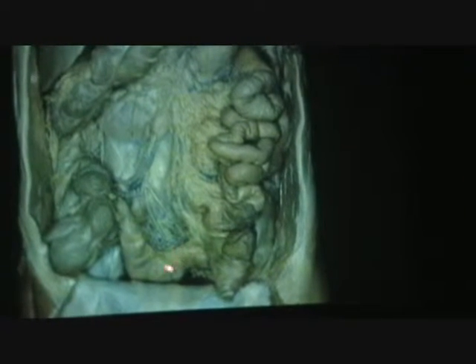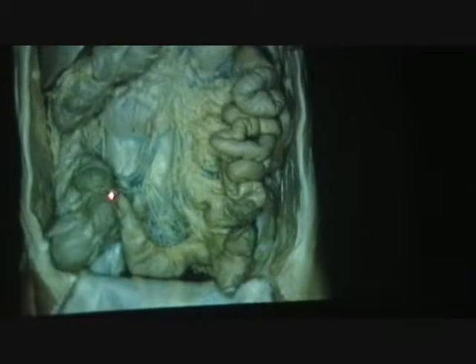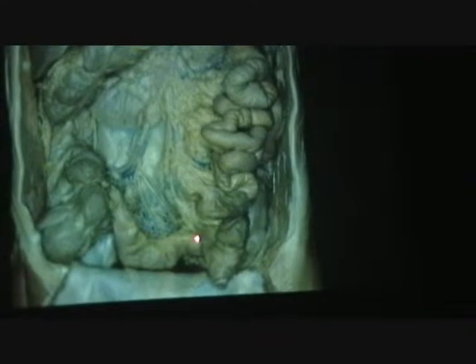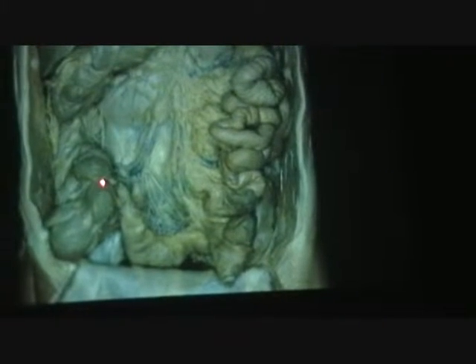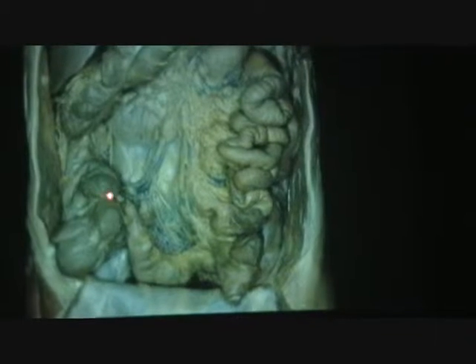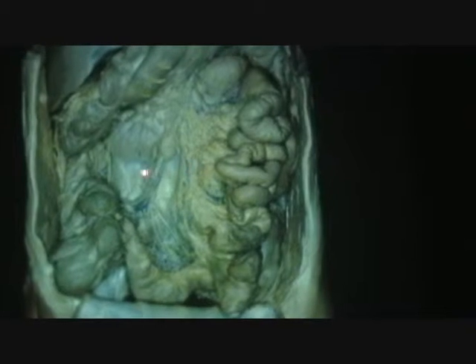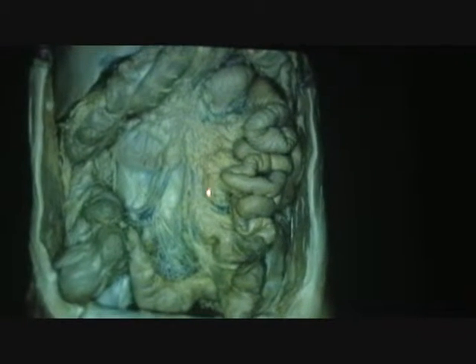What specifically would you call that? Seeing this association. Gotta be the ileum, because you actually see it attaching to the side of the colon in the lower right-hand side. What would you call that? The IC junction. Ileocecum is here. So that's what it was done, to shift this so we could really see a good example of the IC junction. Also to show all of this.